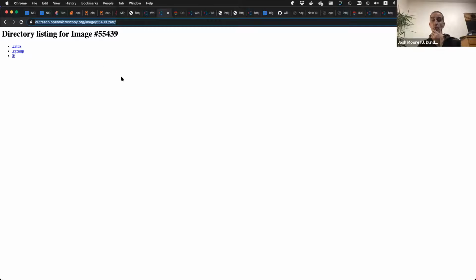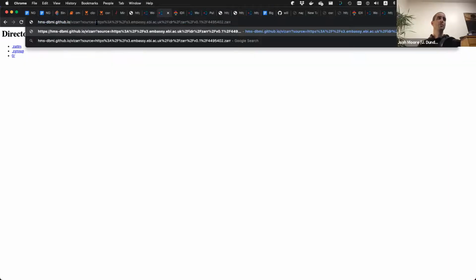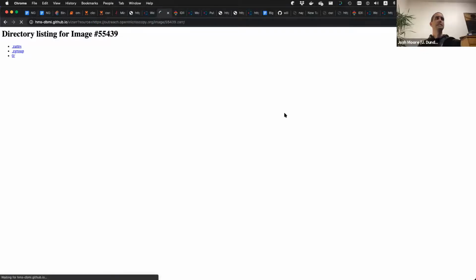So this is an Omero with a microservice that acts like your data is a Zarr. So someone can pass this URL. Actually, I guess can we do that? Let's do it. Oh, wow, this is exciting. So we can pass this to vizarr. I didn't test this beforehand, and let's just see if it works. I don't even know what image this is. Someone want to do a drum roll? It looks like it's pretty slow. We'll keep talking and see if it shows up.